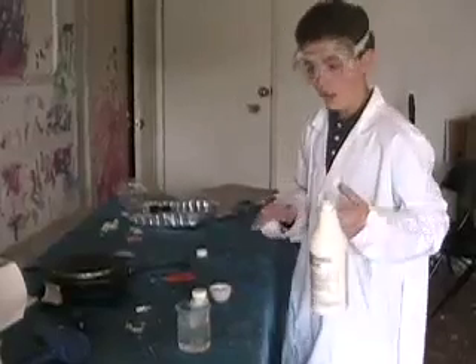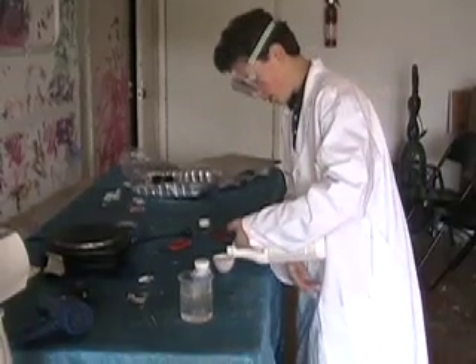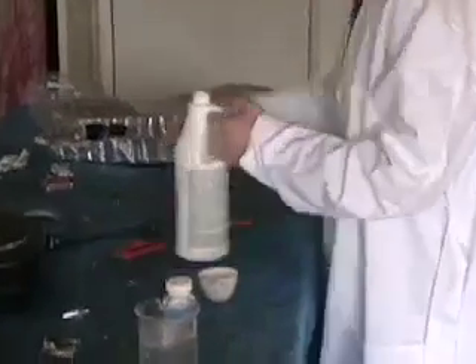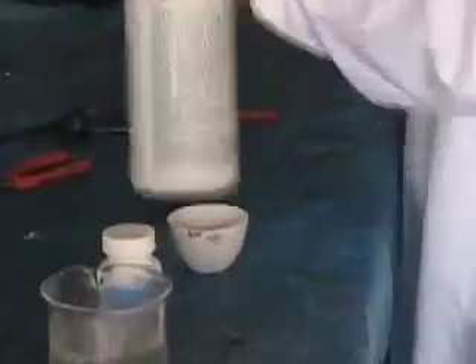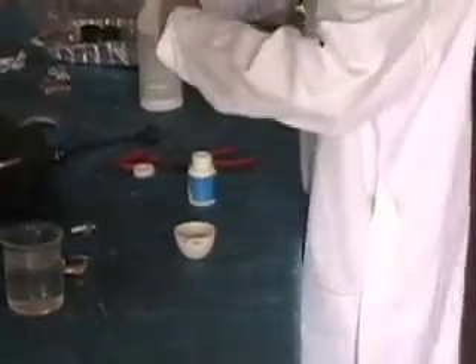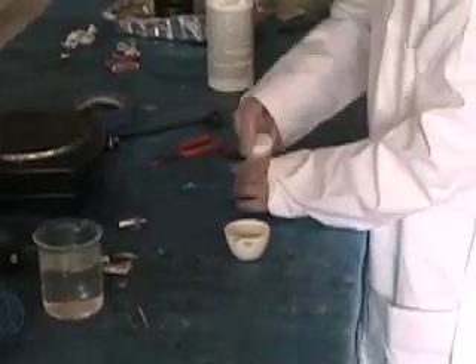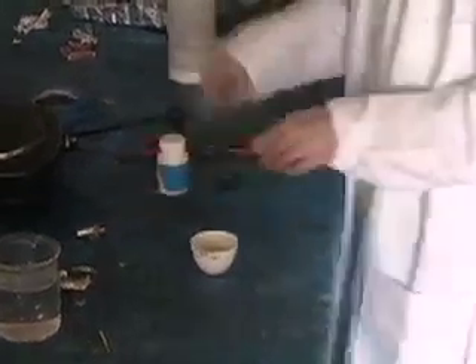So now I'm going to do the same reaction I did earlier, which I thought was going to be very violent, but it wasn't — lithium and hydrochloric acid. Hope you can see it. You can zoom up a little. Get the lithium out, rip it, and I'm going to put a small piece in the hydrochloric acid. Three, two, one, go.